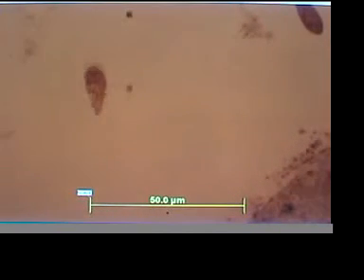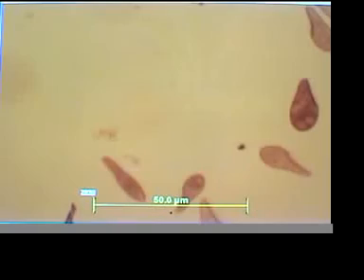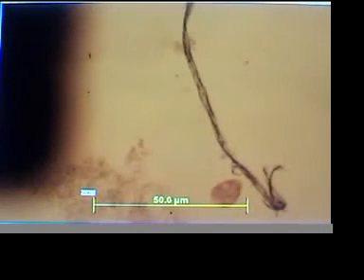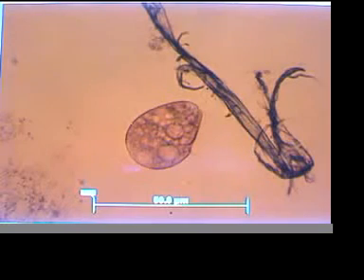So the first two hits that I was able to record on video occurred in this box here. Let me back it out and see where that is. That was grid 7B. Okay, we've been going about 20 minutes and I want to show you that in there's 8 and 9B. Quite a few guys have stopped swimming or are very slow. There's 9B. Here's a guy shaped like a potato, which is usually a sign that he's been devitalized down here. Can you see that one? Good.